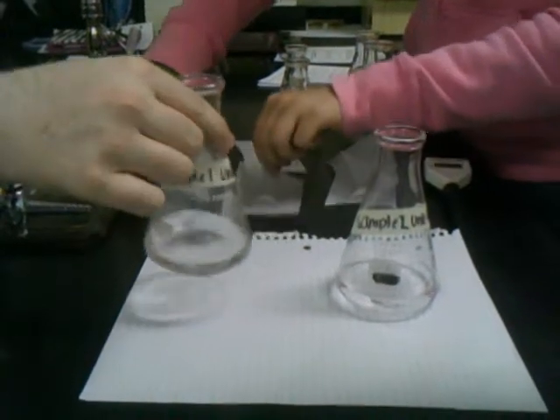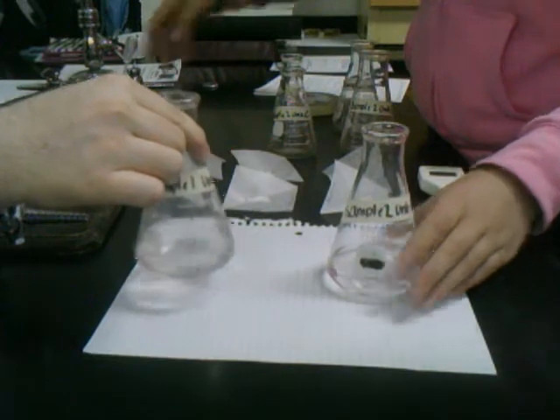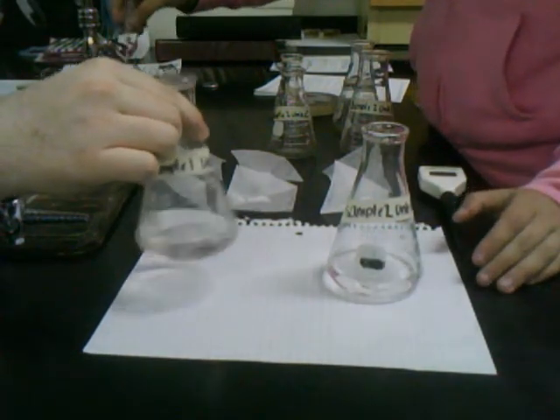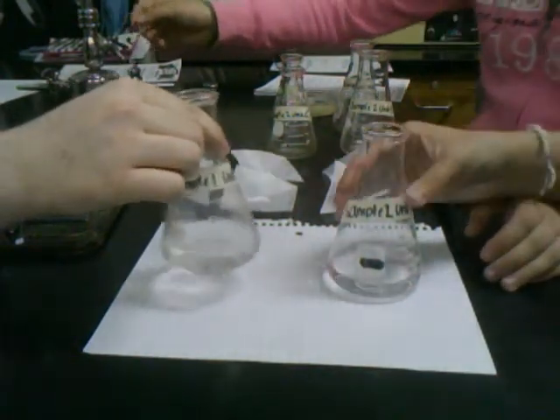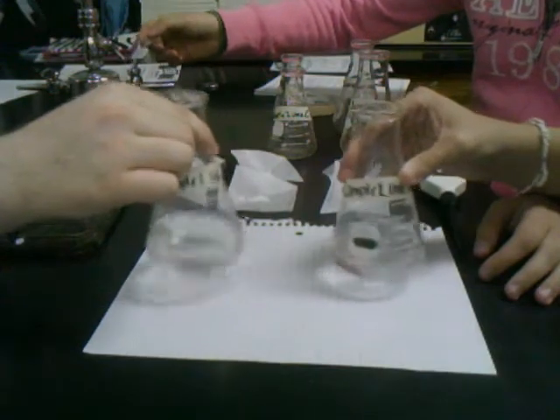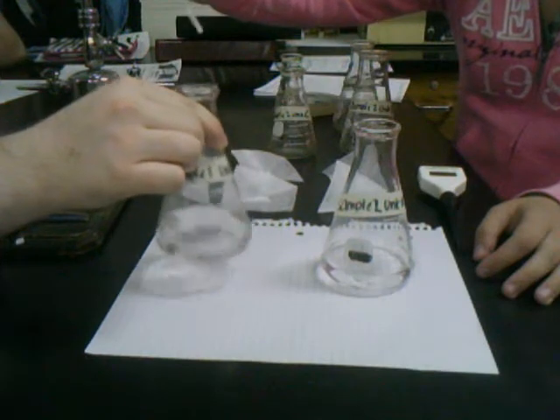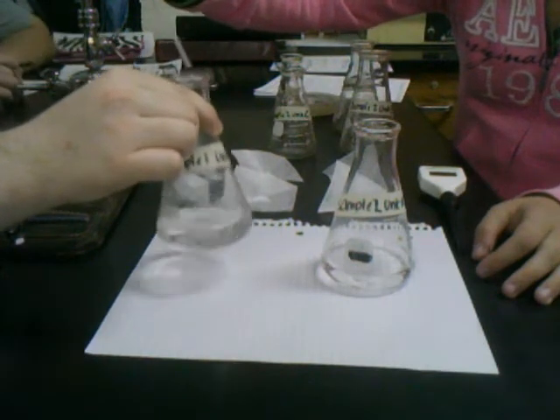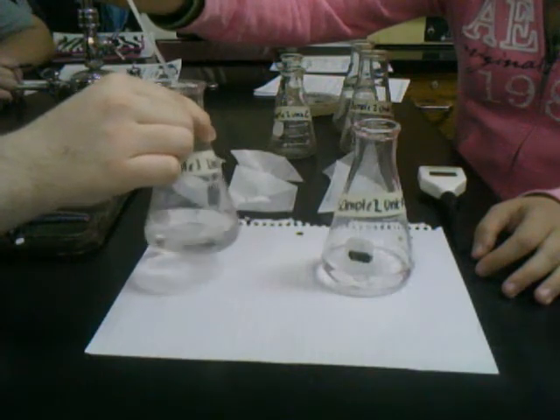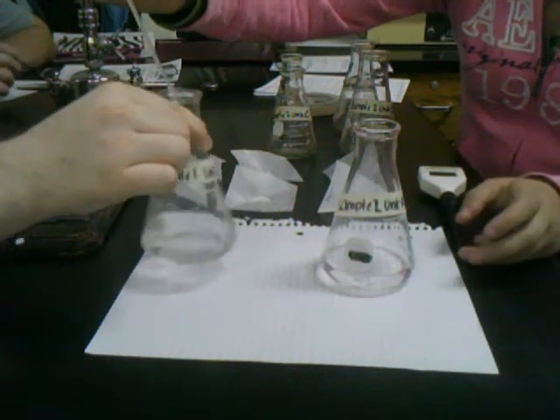We need to make sure it's completely dissolved, and we have to continue swirling to make sure all of the sodium hydroxide is in solution. Now we're about to begin titrating, starting with sample one. Will is going to continue to swirl it as I add sodium hydroxide so that we can make sure it completely mixes in.